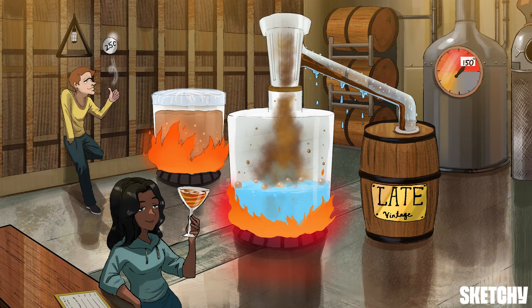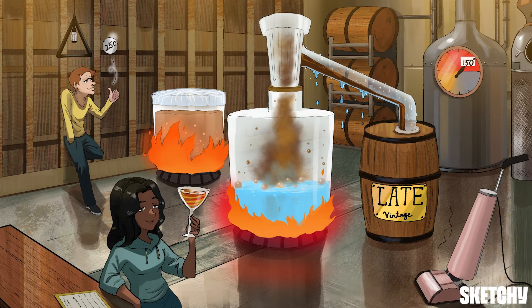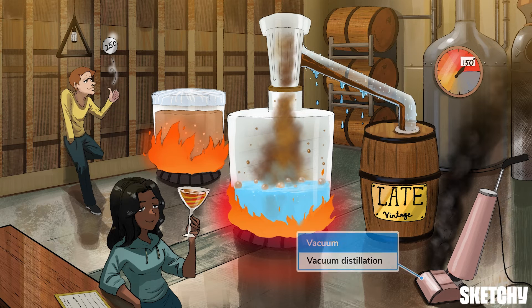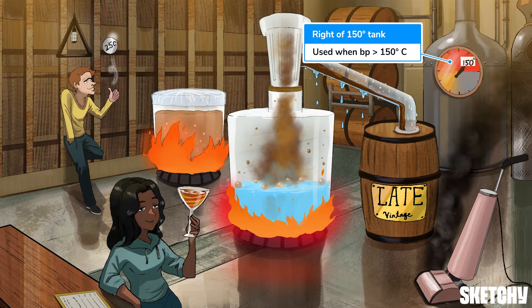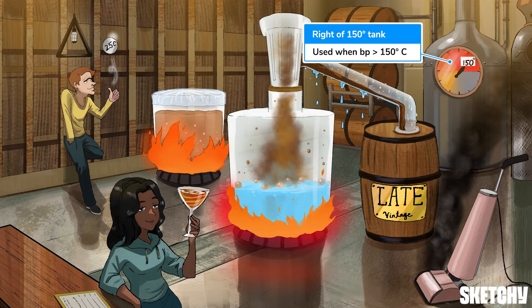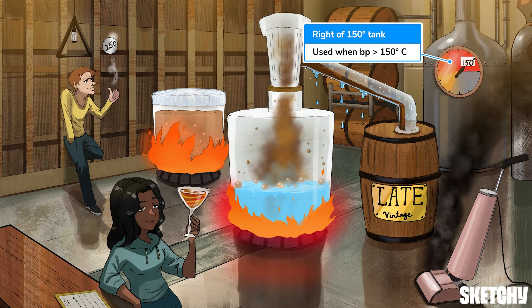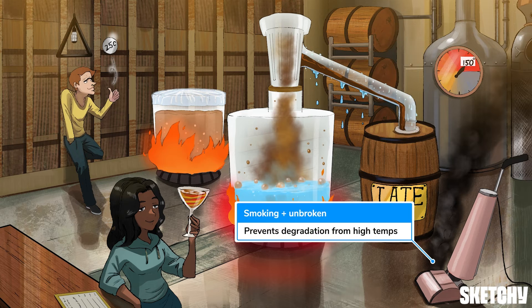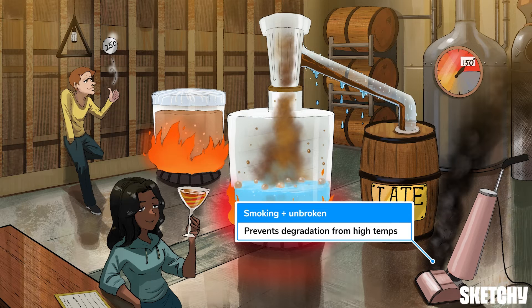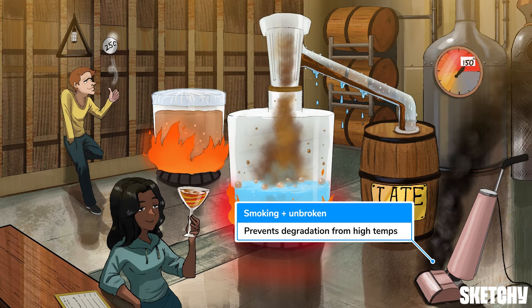Luckily, both of these use the same basic setup as simple distillation, but they each add a slight modification. Let's start with vacuum distillation, which we'll represent with this vacuum. This vacuum is to the right of the 150 degree tank because vacuum distillation is used to purify compounds with a boiling point over 150 degrees Celsius. The only difference between simple distillation and vacuum distillation is that vacuum distillation is done in a vacuum to lower the compound's boiling point. Heating a mixture up too much can degrade the final product, and lowering the mixture's boiling point in a vacuum prevents this.